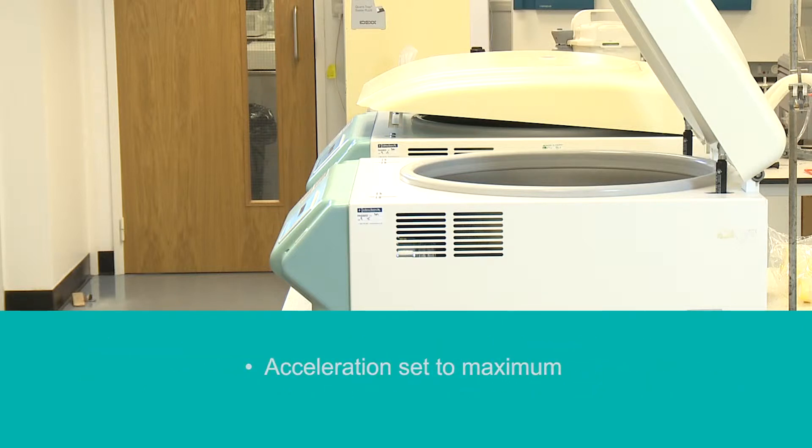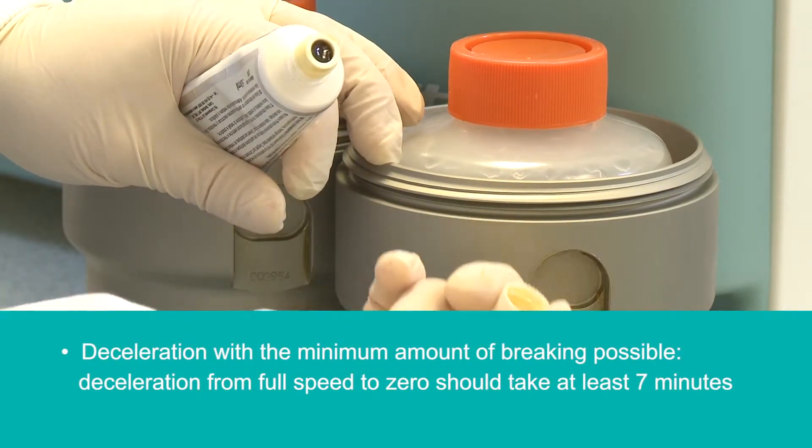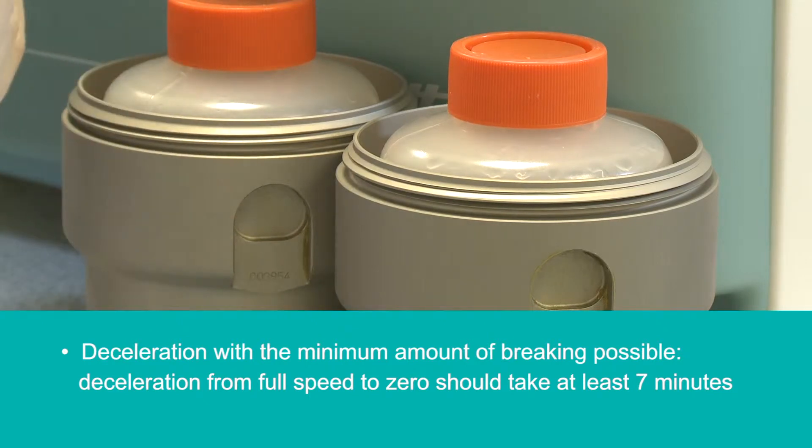Acceleration set to maximum. Deceleration with the minimum amount of braking possible. Deceleration from full speed to zero should take at least seven minutes.